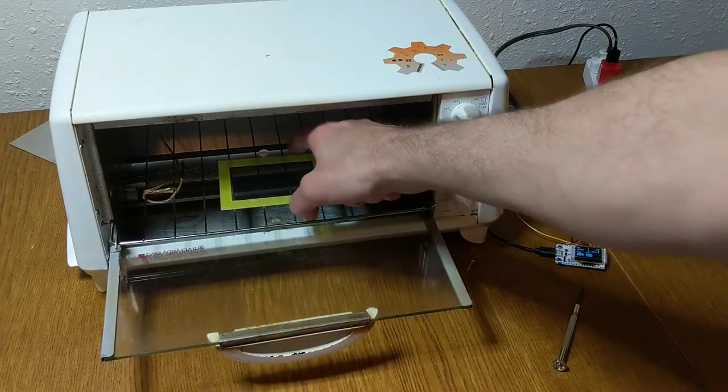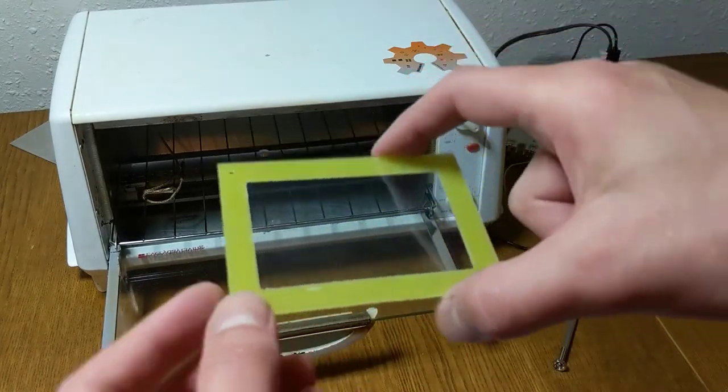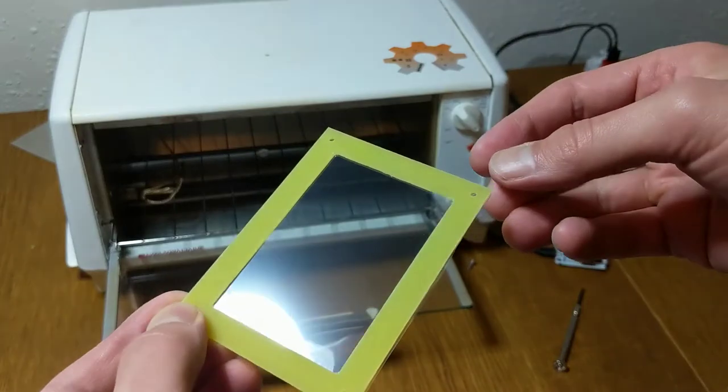After a few minutes in the oven pull that back out and now the mylar is nice and flat and ready for spin coating.